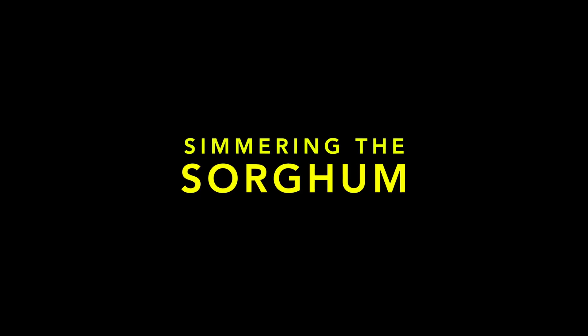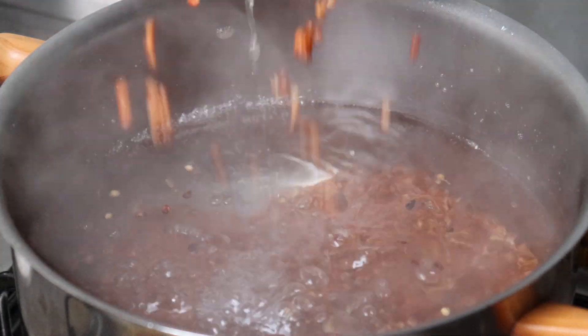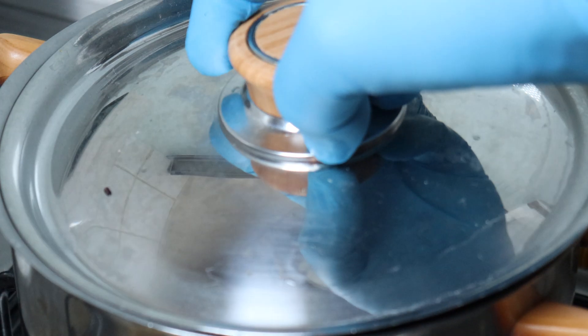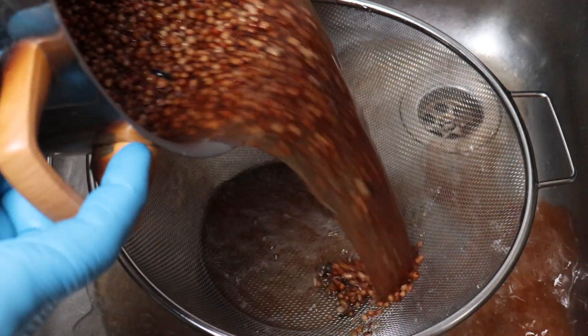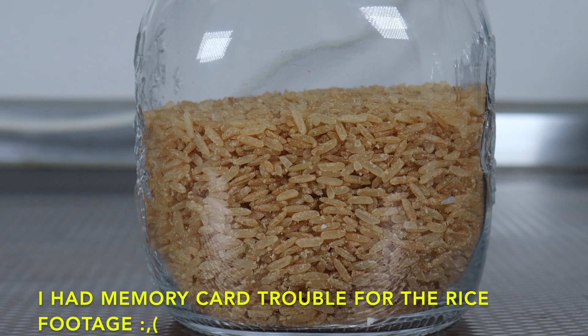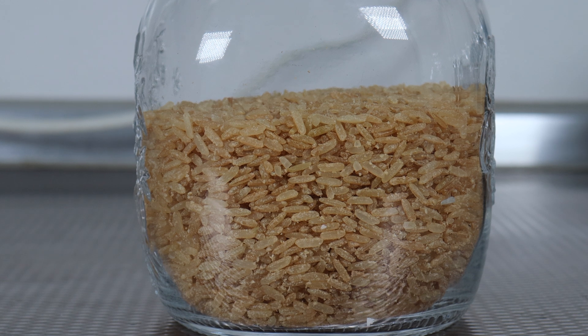And the sorghum is pretty much exactly the same — water to the boil, then I add the sorghum, and I'm going to simmer this for about an hour before straining. Then once again we let it dry off. So the rice I used in this video is parboiled, which means it's been pre-cooked a little bit already, meaning my prep time is actually only four minutes of simmering in boiling water. However, your rice may be different. But ideally you're going for a half-cooked consistency. If you can get that, it should work. I do have another video where I talk about it. Four grains in five jars, ready for the pressure cooker.